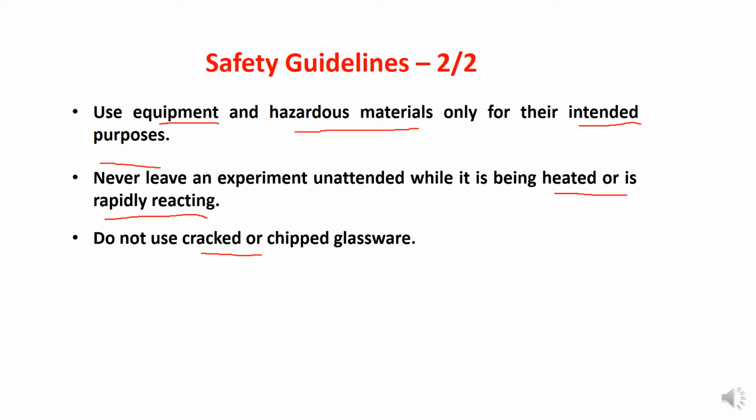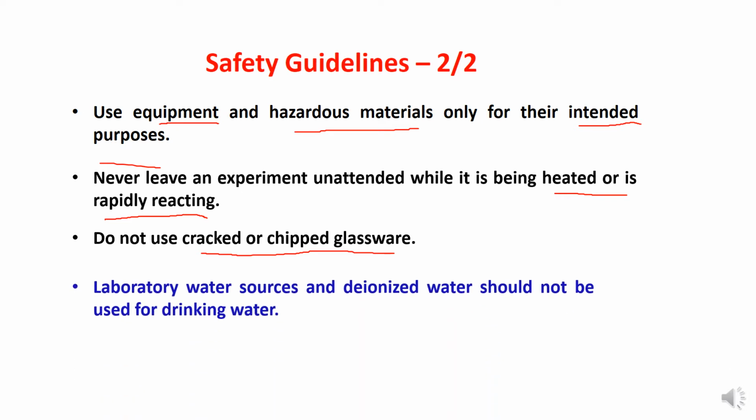This is very important for your safety. If you are going to use any glassware and you see that it is cracked or damaged, don't use it. Just dispose of it in the designated area and use a new one.